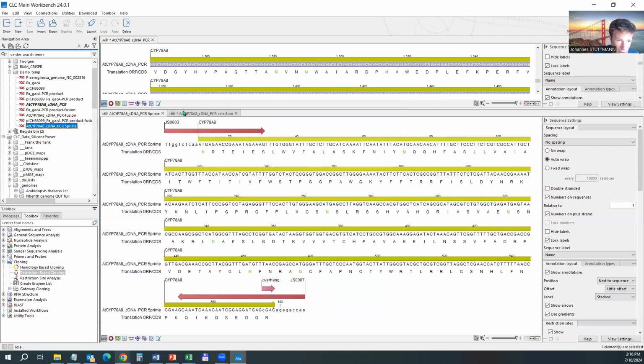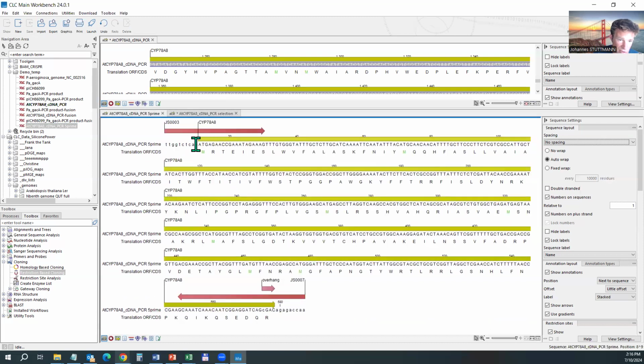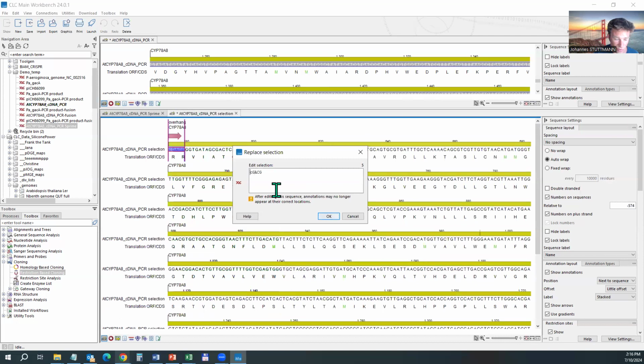This would be the 5' part. And now here on the second one, I can make my life easy as well. I just take this adapter sequence. So that's basically my BSA1 site until including the N.